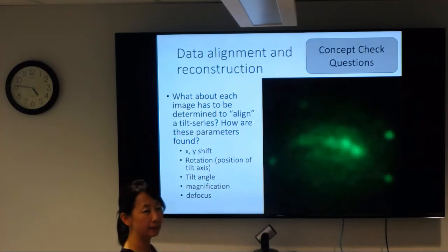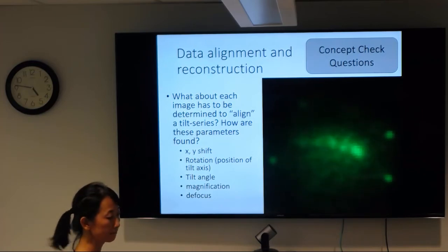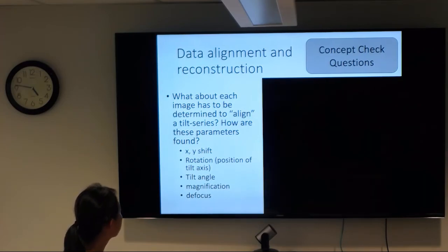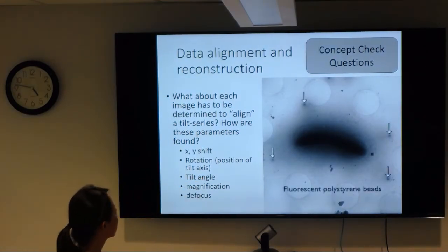It's like a blinking, sequential activation of different subsets. This one is when you zoom out to look at the whole cell. This is the geometry. Pay attention to the ice. The ice is actually not that good anymore. Look at the ice quality.